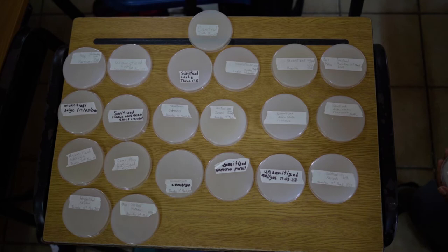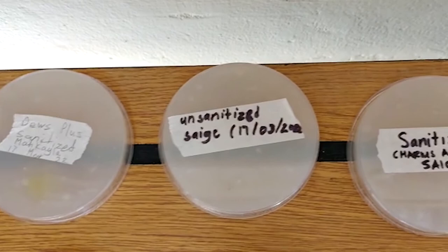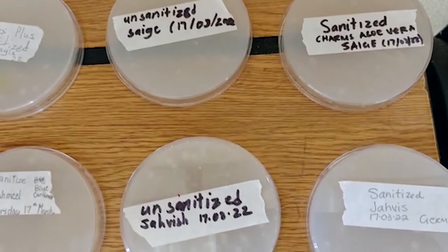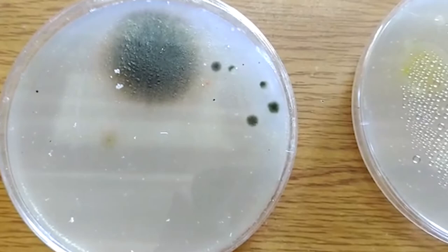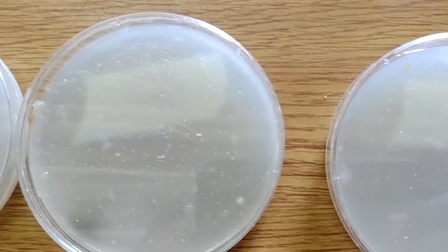We observed the plates daily. On day one of the experiment, as expected, the plates remained unremarkable. By day four of the experiment, we noticed small white dots on the plates, including the plates labelled sanitized. One of the plates had some black spots on it. After eight days, three out of the eleven sanitized plates had very little bacterial growth. All of the other sanitized plates had almost equal growth as the unsanitized plates.